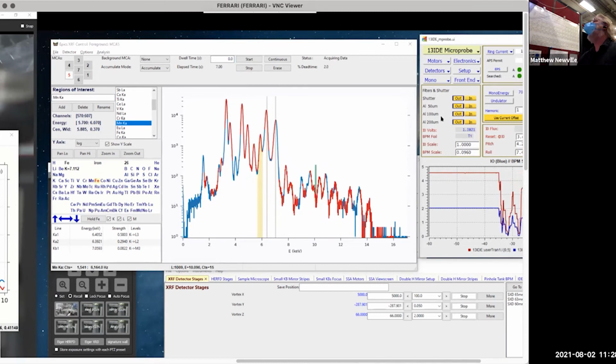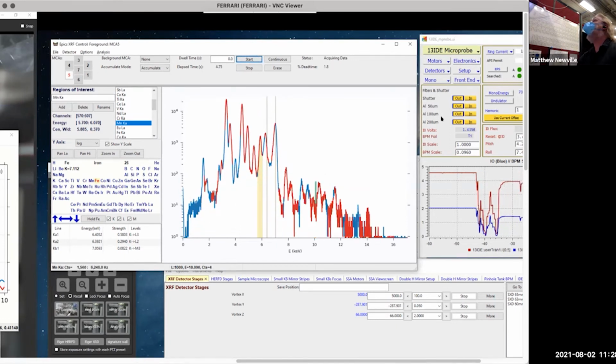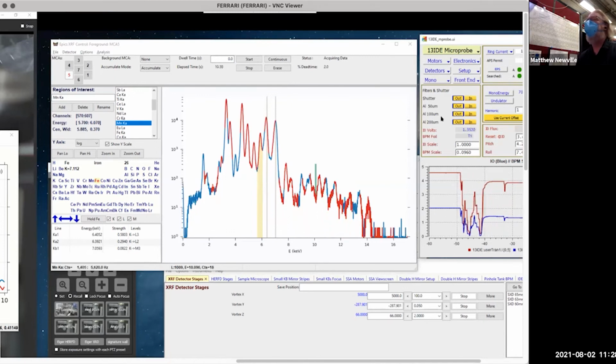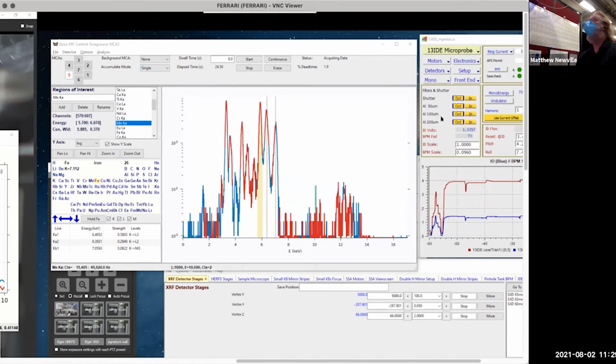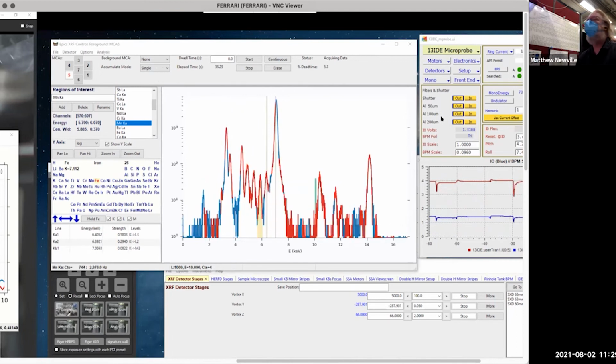I'll just turn that down a bit more. We can see iron. Here, this peak here, better. And we'll see the other elements as well. And I'll tell you that I'm doing this, but you can't see it. So I'm just going to move the sample around in the beam. You'll see that as I do that, the different elements move around. Huge peak there.